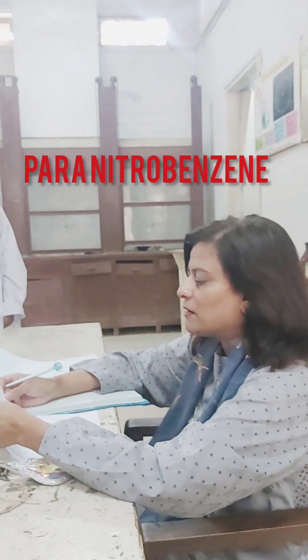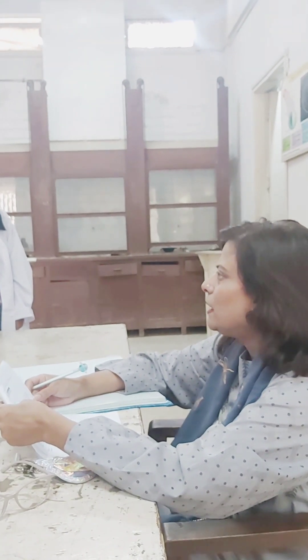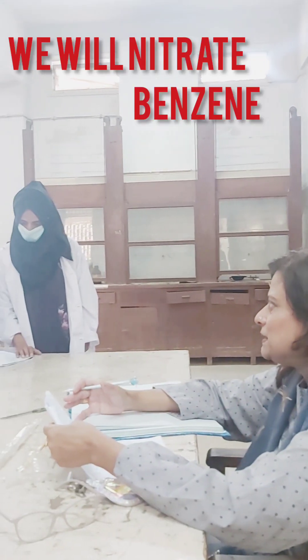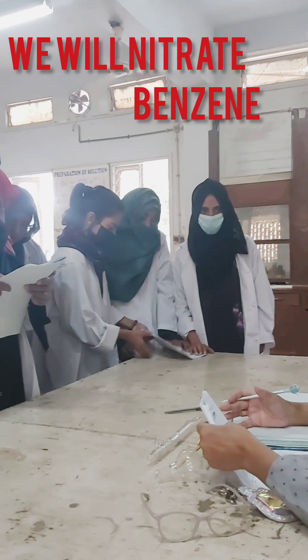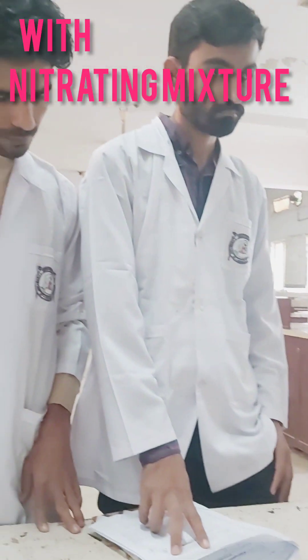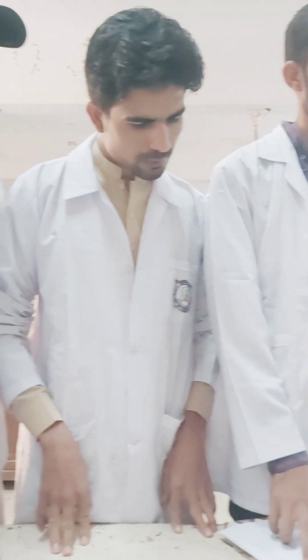The nitro group will be attached at the para position, with the release of a water molecule at the end. This is simply a reaction in which you are going to nitrate benzene with a nitrating mixture. I hope everyone knows what a nitrating mixture is — it's a mixture of concentrated nitric acid and sulfuric acid. First you are going to do the mixing, and then attach it to a reflux condenser.